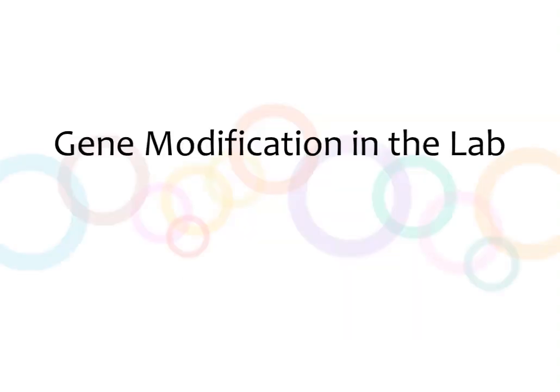All right, so now that we've talked a little about CRISPR, let's take a minute to talk about gene modification in the lab. So this is sort of a step out. I'm just going to talk about gene modification in general before getting deeper into CRISPR, because I want to make sure that you understand how we actually modify genes, and that will explain better how we can use CRISPR in the lab to modify genes as well.